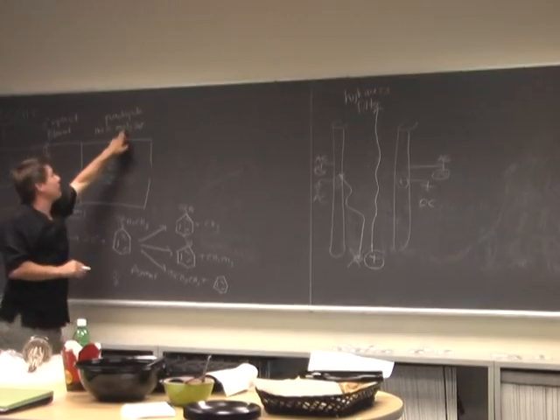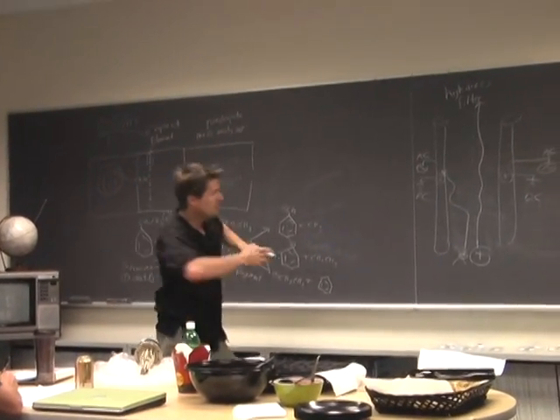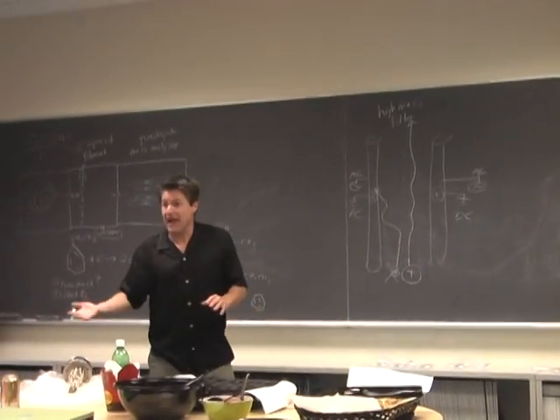So we call this a high mass filter. I like the term filter better, a quadrupole mass filter. It's actually filtering out rather than analyzing it, right? So only the big ones get through above a certain mass to charge ratio.